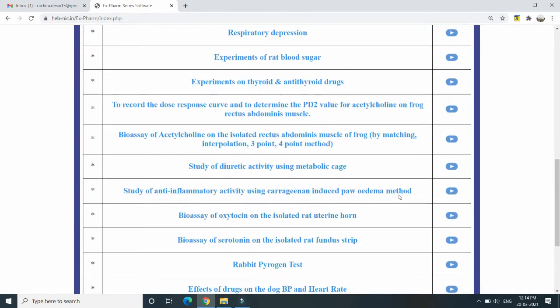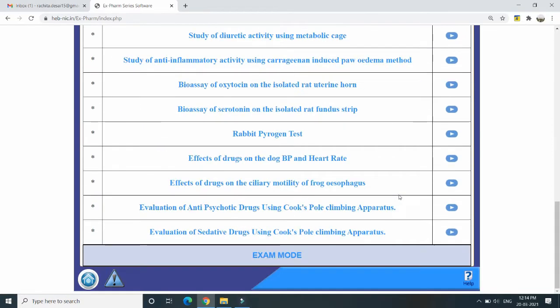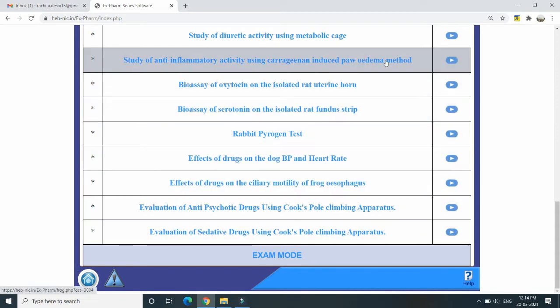We can discuss the practical studies covered as per your PCI syllabus. Today we will see the plethysmometer, that is the study of anti-inflammatory activity using carrageenan-induced paw edema method. Other screening models are also available, like the tail flick method for analgesics, diuretic activity using metabolic cage, bioassay models including DRC curve, matching method, graphical method, 3-4 point method, rabbit pyrogen test, and effect of drugs on blood pressure and heart rate. All these practicals are covered in your syllabus.